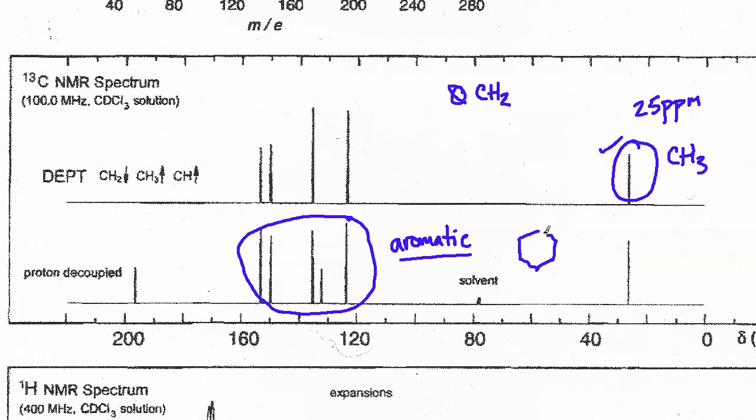And so if I see 5, that would potentially suggest that I've got something considered an asymmetrical ring. Because if I have 5 carbons and there's a total of 6, I really probably should see 6 peaks if there's no symmetry at all. So we'll have to figure out what's going on there in a minute. However, what we can determine is that we certainly have an aromatic set of carbons here.